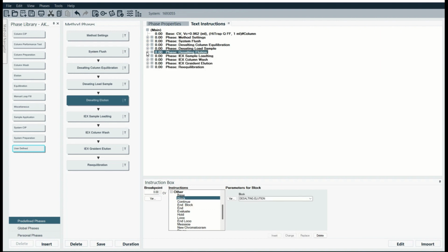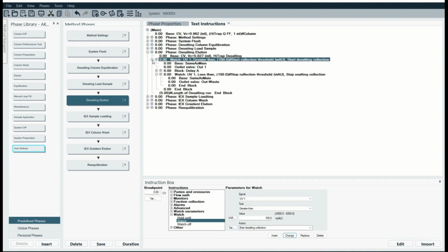Okay, I think we're doing pretty good. Okay, so now we've collected everything into the loop, right? And did we close the loop? No, not waste.